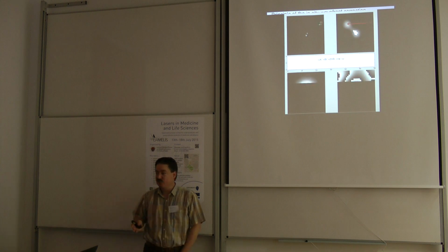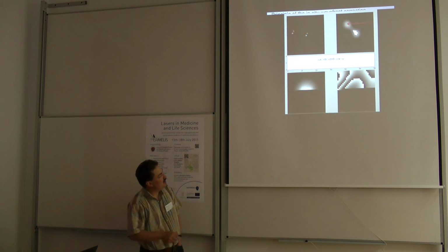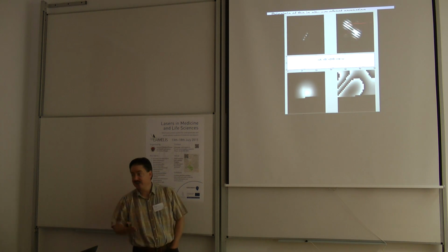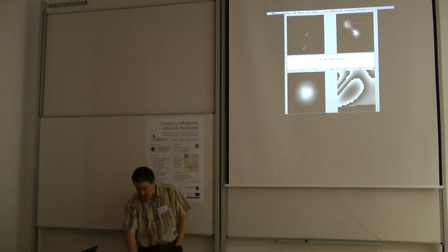And then I do the same trick for all these windows and scan the system one by one, which allows me to measure the phase very nicely. But also because the interference term is given by this extremely simple equation, which is basically a cosine, I can also measure the amplitude relatively. So it's a very fancy profiler that tells me everything that I have in my system.